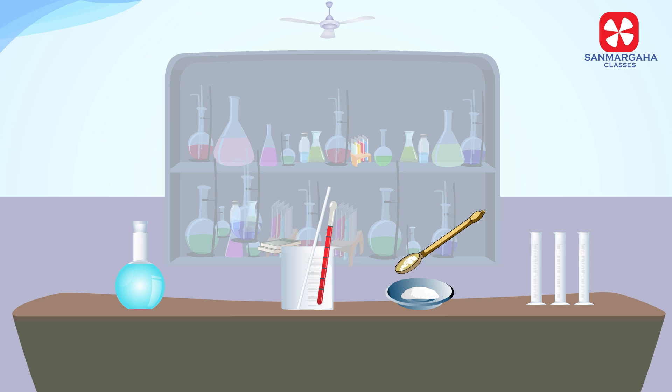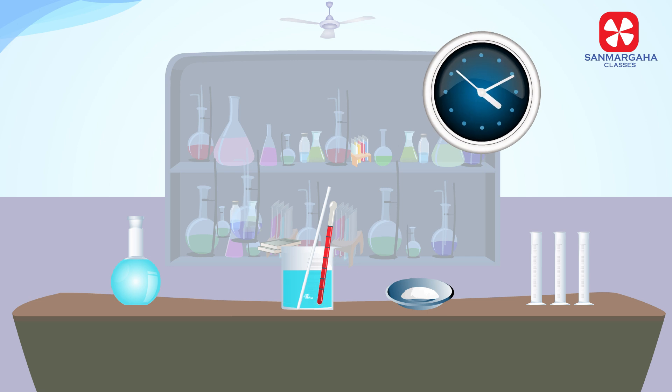Take a small quantity of quicklime using a spatula and transfer it into a beaker. Add water slowly to it. Introduce the laboratory thermometer and record the initial temperature of water. Wait a few seconds for the reaction to commence.